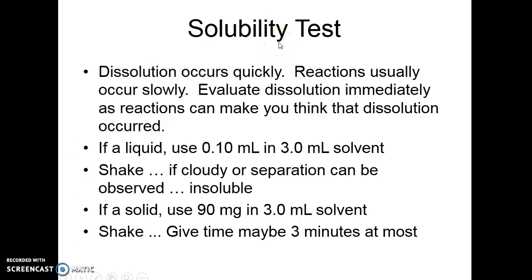When you do your solubility test, dissolution will occur quickly, let's say in a minute or so. If you set your test tube on the counter and you look at it 10 minutes later and the compound's gone, that is not dissolution. That probably is that the compound's reacting. So you have to be careful in your judgments here.